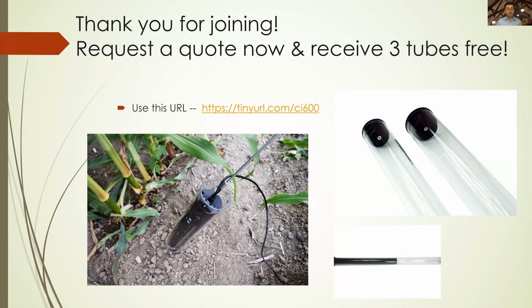The next question I see is, does it produce 3D root system architecture? Right now, no, but that is actually a really good idea for future development.